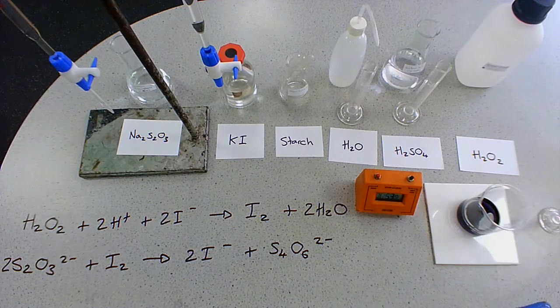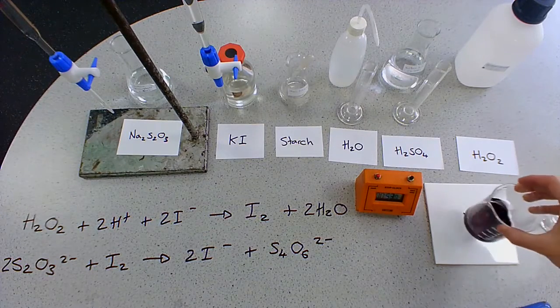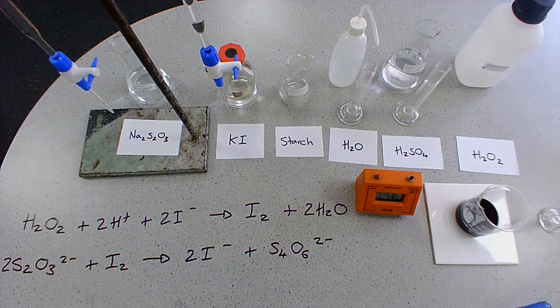And there we have our very sudden color change. It went from being colorless to this very, very dark color, and it took 53 seconds.